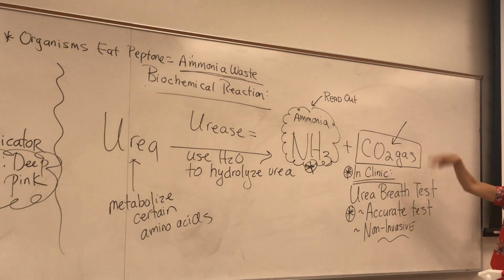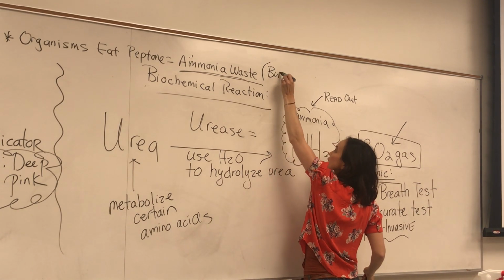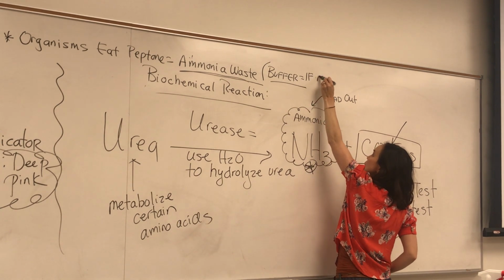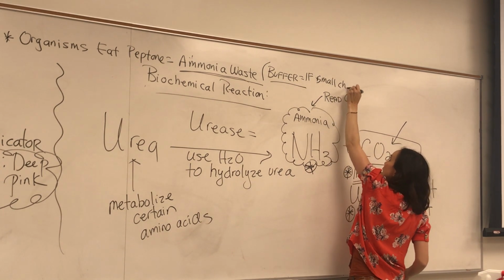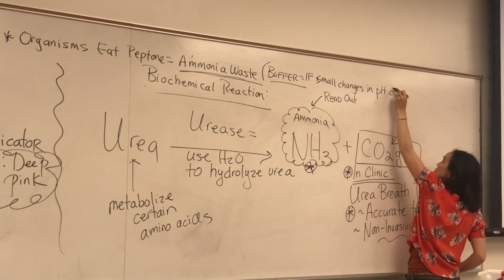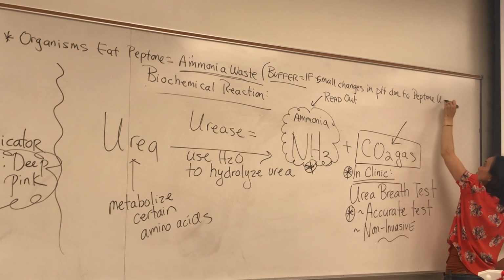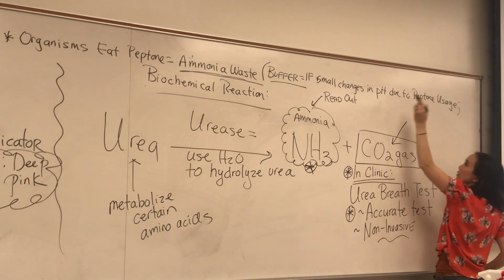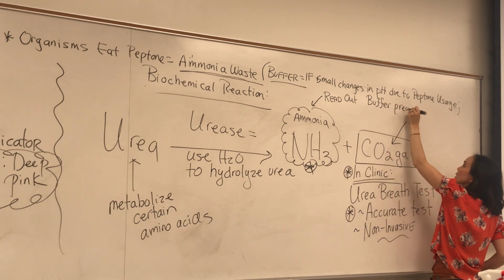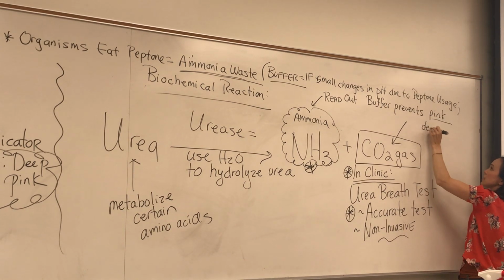We don't want to see ammonia from the peptone. So basically they included a buffer so that if there are small changes in pH due to the peptone usage, the buffer will prevent your media from turning pink. So it'll prevent the pink development.